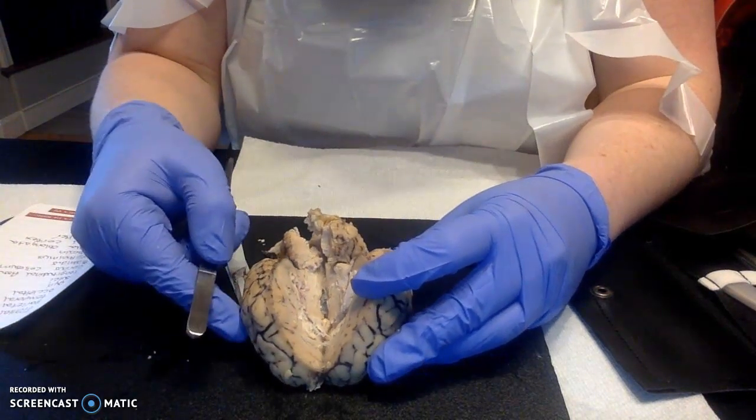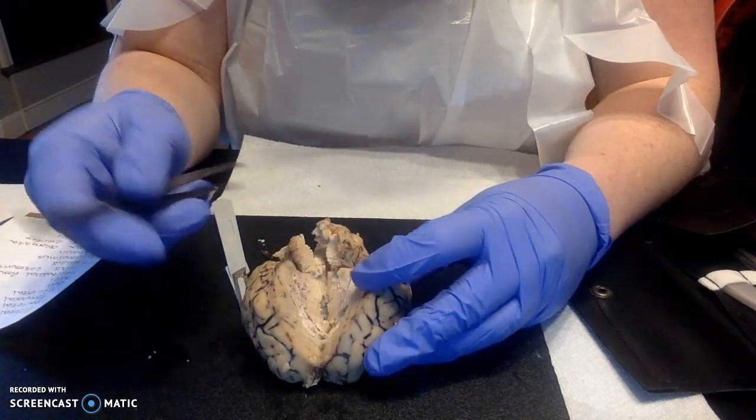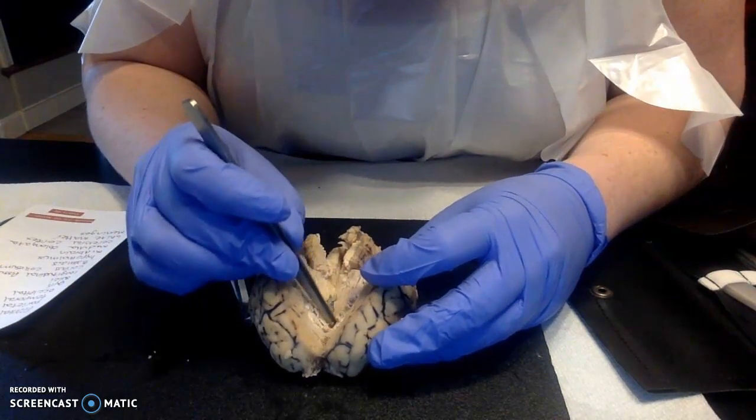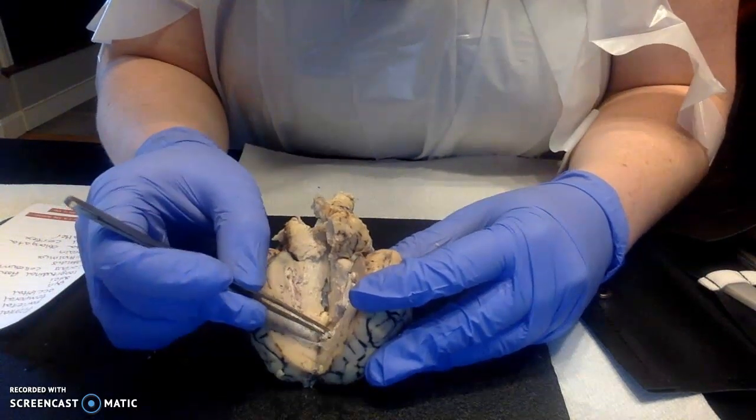The hypothalamus is right here. You can see where I'm there.